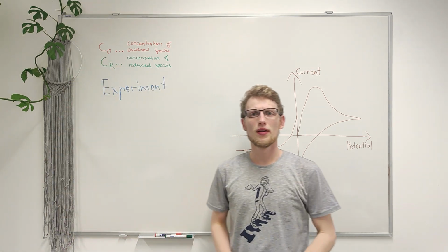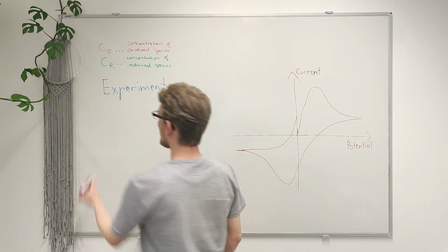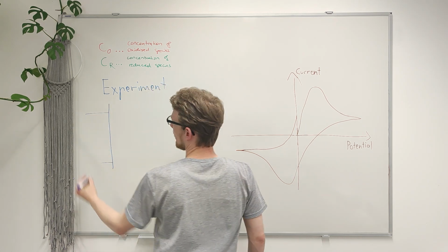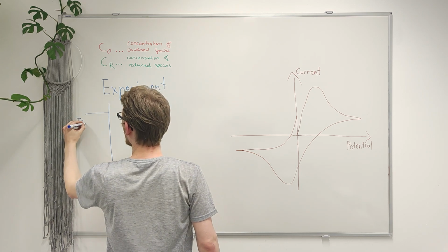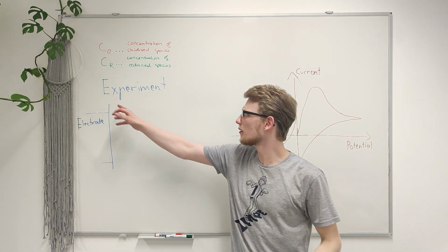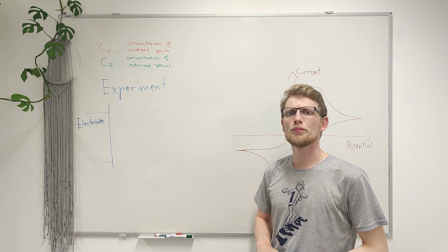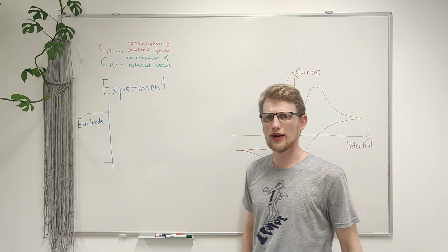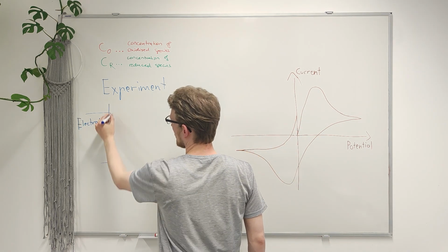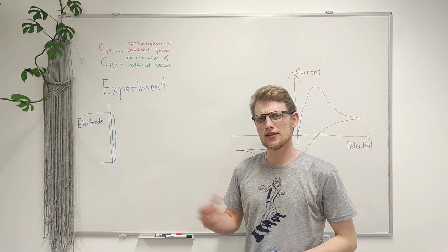First of all, we have to have a look at the macro electrode that we have used and how the diffusion layer formed at it. So our electrode here, it's an embedded polymer, and if we now have electrochemistry going on there, we get a diffusion gradient right at the electrode, like this. And we have to consider that this gradient is quite small.